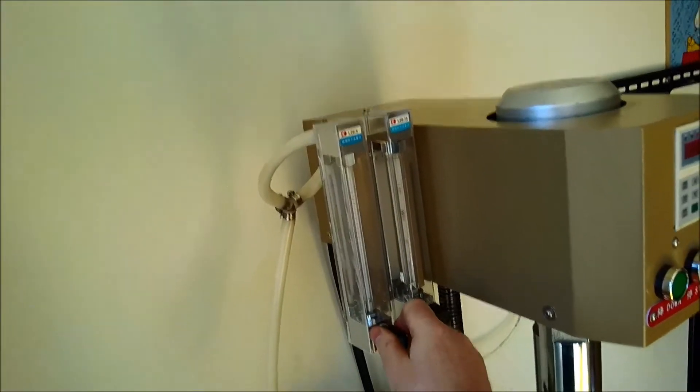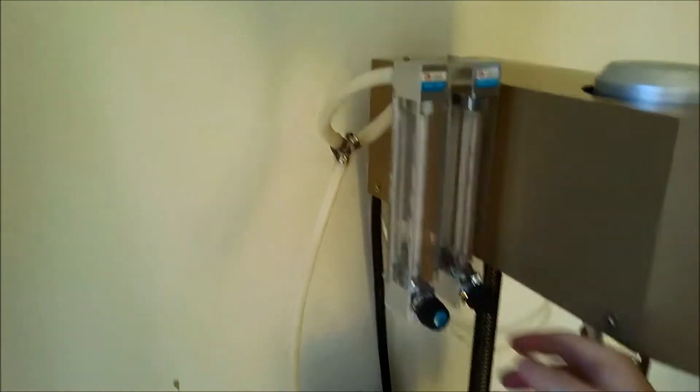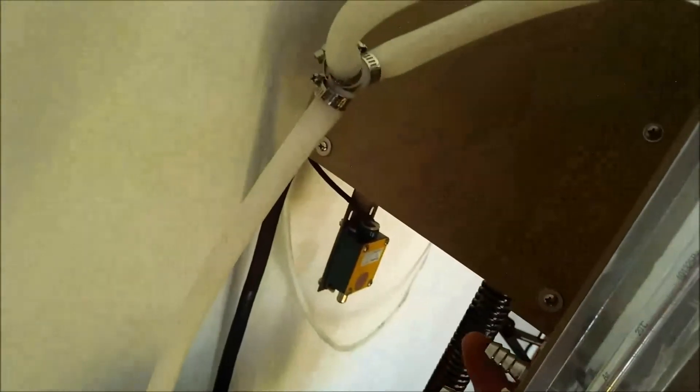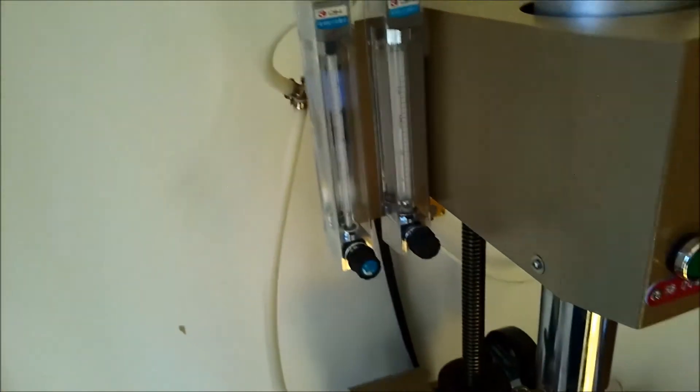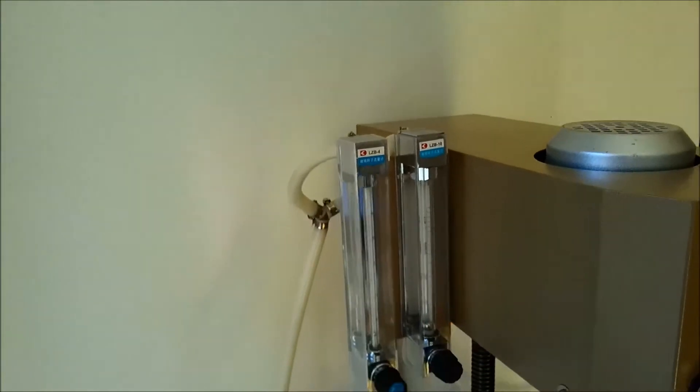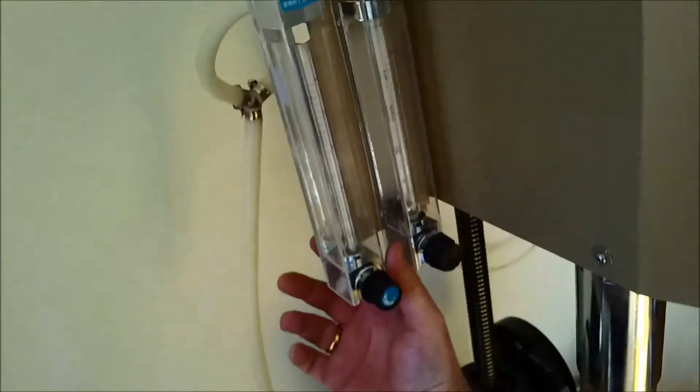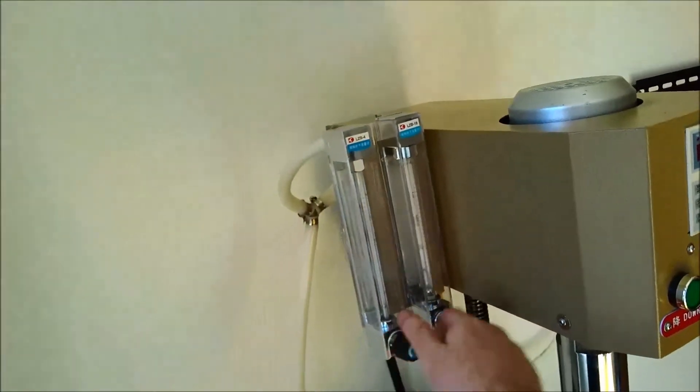It has two air controllers in which you would inject air in the back here. You could, if you're doing a nitrogen flotation or any other inert gas you want to use, or just pressurize there. These would be your controllers.